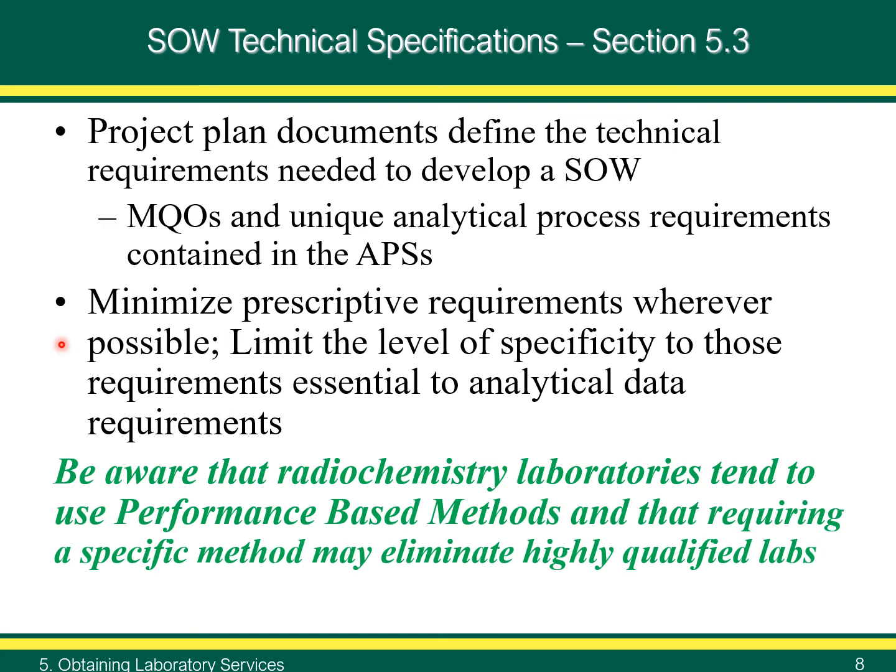Performance-based methods are methods that are selected by laboratories to specifically meet program requirements. Often laboratories modify existing methods or even develop new ones. Note, however, that all methods, prescribed or performance-based, should be validated for the analyte matrix and activity range expected for the project prior to use.